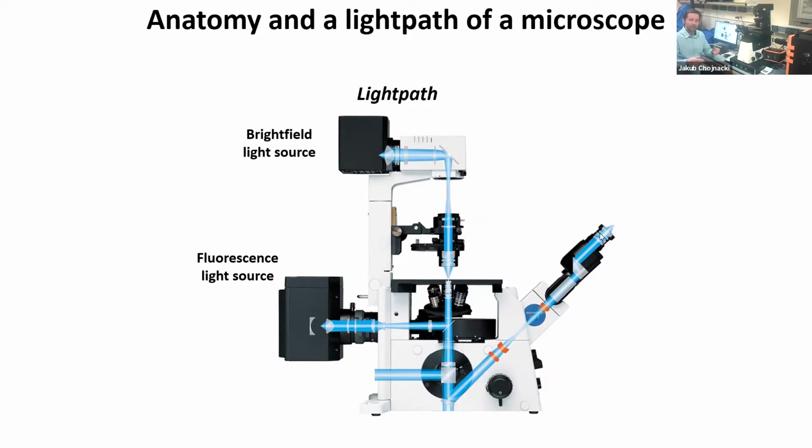While human eyes are a very powerful tool, because they're connected to our brains, which is an extremely powerful processing organ, in many ways it's still very useful to see things with your own eyes. That's why a lot of microscopes have oculars on them. However, that is not really necessary. There's nothing stopping us from building a microscope that just has the other elements where you detect fluorescence, and you do not need this ocular.